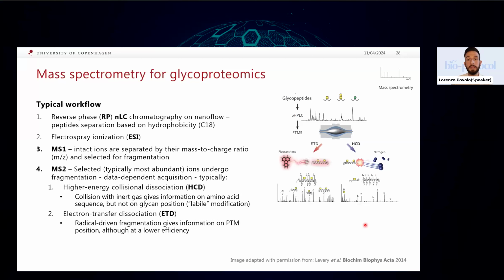And we combine it also with the ETD fragmentation, which is a more mild type of fragmentation that leaves the glycans more or less intact and conjugated to the protein backbone. So it's possible to evaluate also hybrid methods, for example, EThcD or ETCAD, which allowed the characterization and the discovery of the glycoproteome in, for example, human cells. So more on these can be found, for example, in this reference, and the references in a couple of slides.